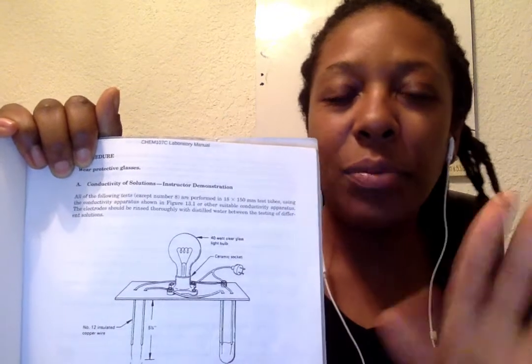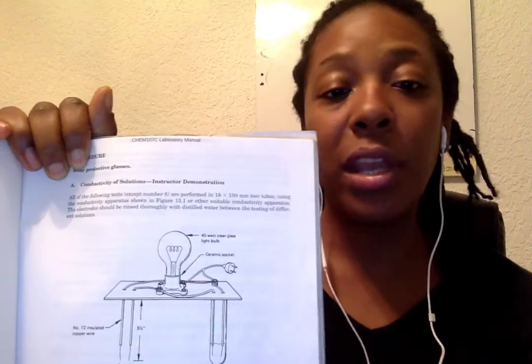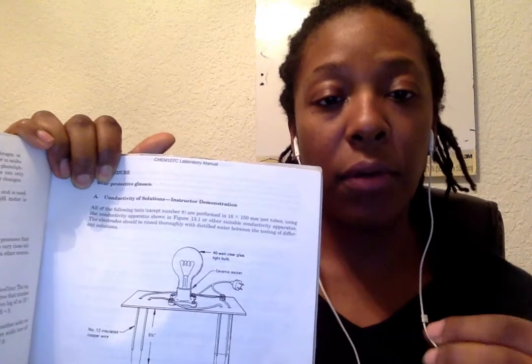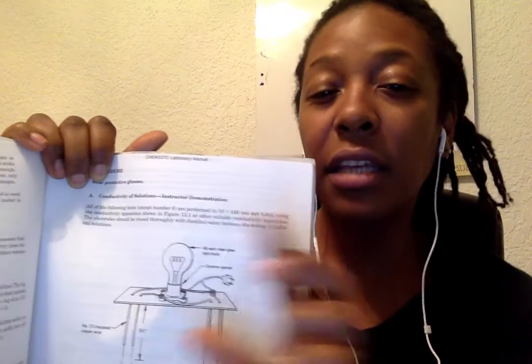If it's a strong electrolyte, this light bulb will completely turn on. If it's a weak one, then it'll be kind of dim. It'll be a little bit of a flicker, but not as bright as a really strong light bulb. And then the non-electrolyte, there'll be nothing that happens. Okay, so that's basically all you're looking for when you're looking at each one of these videos. You're trying to see, does the aqueous solution that she used turn on this light bulb strongly, right? Because that's about conducting electricity. So does it strongly conduct electricity? Does it slightly conduct electricity? Or does it not conduct electricity at all?